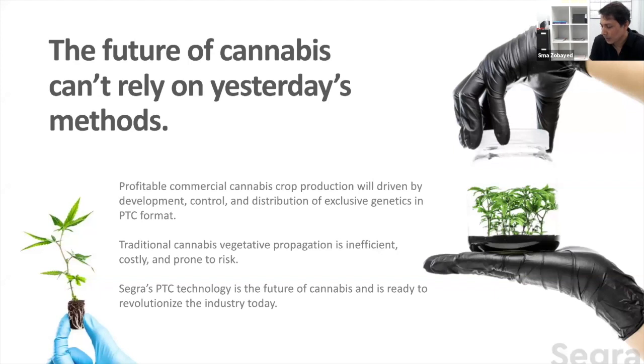including the multiplication. We can actually drag the multiplication from 2 to 4 or even 6 times multiplication, depending on your demand. In this industry, in this plant species, we don't want to drag these plants from high multiplication straight to the rooting. That's how you lose the plants a lot of the time in the multiplication. We have to go through stronger plants produced in vitro and then do the rooting. That's the secret of these plants. So we have to be patient with these plants because it's an annual plant.